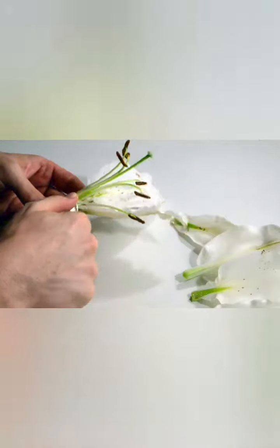Let's take a closer look now at the male reproductive part of the flower. This part is known as the stamen, and the stamen contains the anther supported by a stringy thing called the filament. The job of the anthers is to produce pollen. The anthers produce the male gametes of the flower. In the earlier stages of blooming of the flower, you can see the pollen starting to burst out of the anthers, but once the flower is more mature, they're a lot more exposed and readily released from the anthers. You can see these coming off here as a sort of dust.